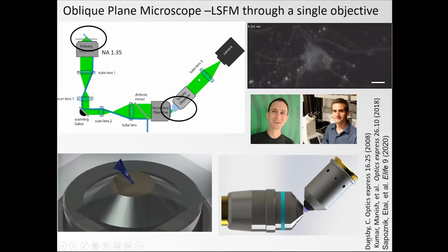So you can imagine if you angle these optics here, then a lot of light coming from the left would just sail past it and wouldn't be picked up. But this objective has kind of a glass frustum or snout at the front, which helps collect more of those precious photons and direct them to the camera. And as such, the resolution wasn't too bad, around 300 nanometers spatially. So similar, if you want, to a lattice, but with the benefit that you have just one objective at the business end. All right, so this is OPM and also why we got interested in OPM.